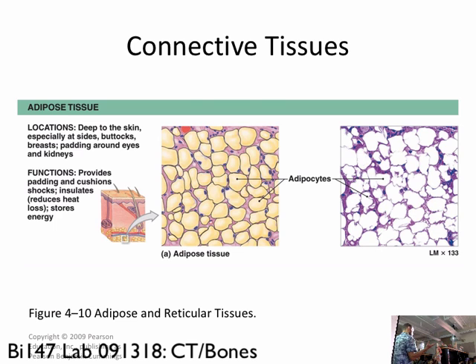These are cells that make the fibers we're talking about, the elastic fibers and the collagen fibers. Right? So fibroblasts, any kind of blast is not a fully differentiated or fully matured cell type. And if you see cyte, again, that means it has fully matured. Okay? So adipose tissue is fat tissue. Adipocyte is a fat cell. Okay? So adipose tissue, there's not a whole lot to look at. You're going to see they're mostly empty space. Looks like empty space. That's not actually empty space. Those are big balloons that are entirely filled with fats, lipids.